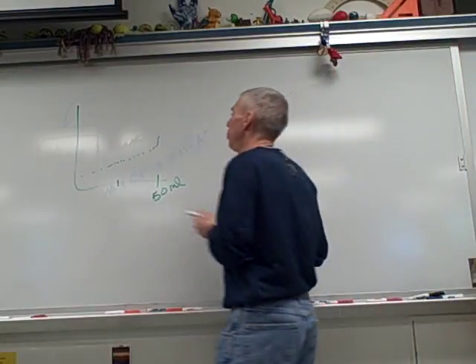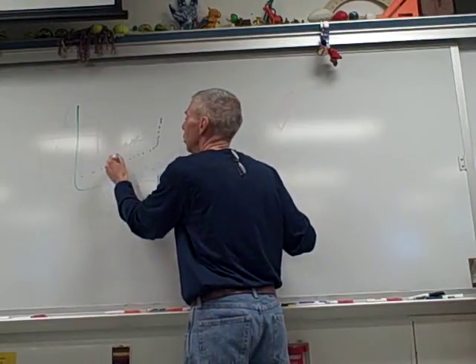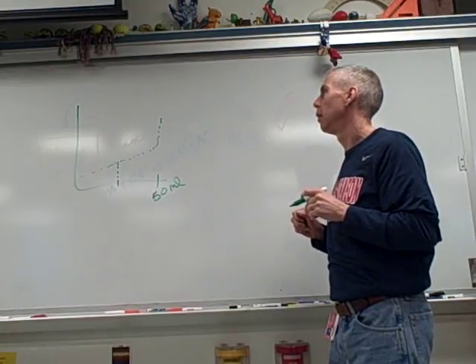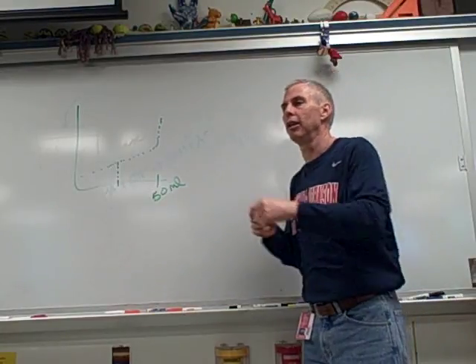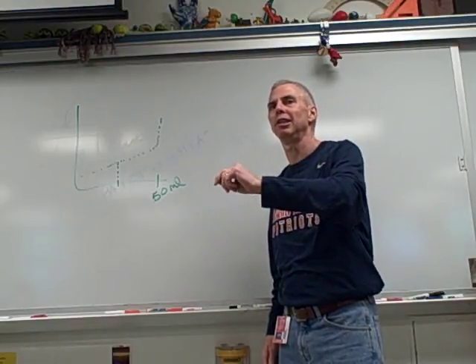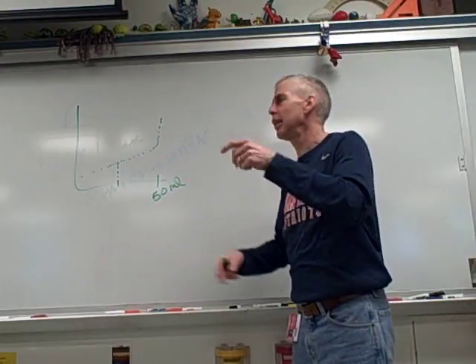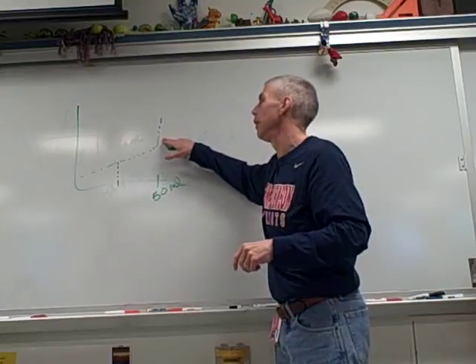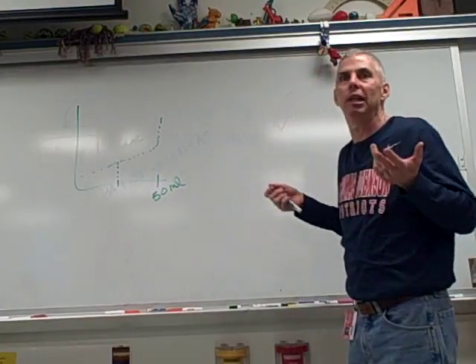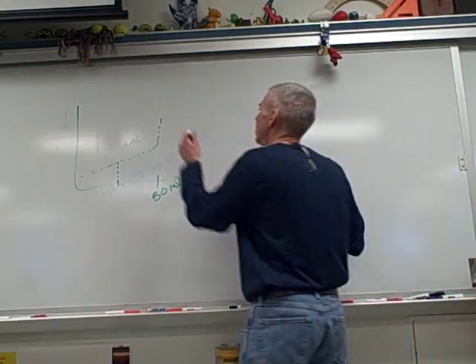The two important points are the exact equivalence point and the half equivalence point. So those are where you take your time. Because literally, I've seen people sit there adding like 2 tenths all period, and they get 1 titration done. First one is slam it, get it pretty close. Second one is slow down here and here. Then do 1 more like that, and you should be able to get a really accurate graph in minutes. Okay? Now, questions?